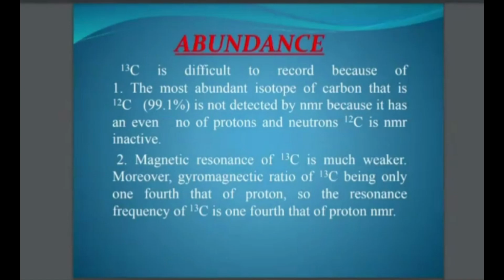C12 nucleus will not have any magnetic moment. So whether you are keeping it in an external magnetic field or not, it will not perform precessional motion. Now, think and answer. C12 nucleus, I repeat, C12 nucleus, it has a spin, but it cannot perform precessional motion. Do you think it is true or false?